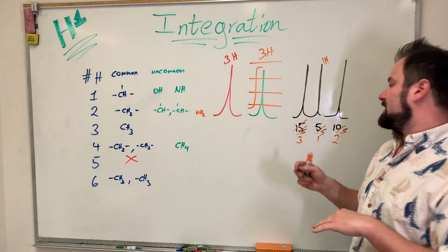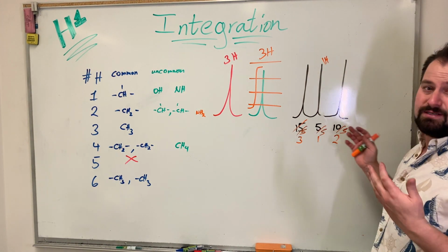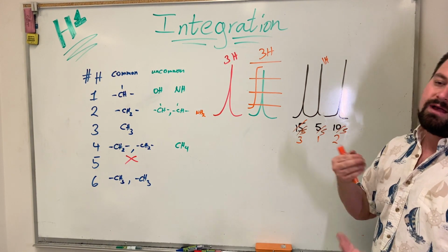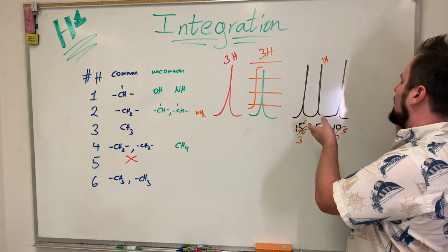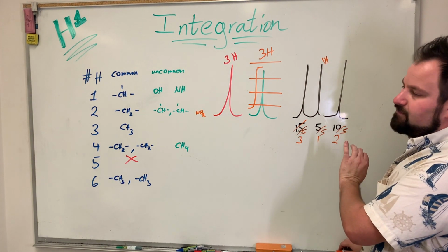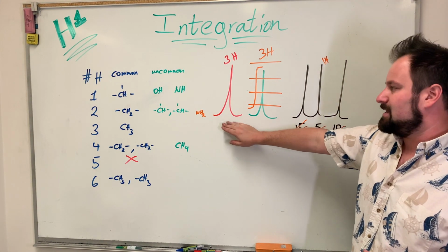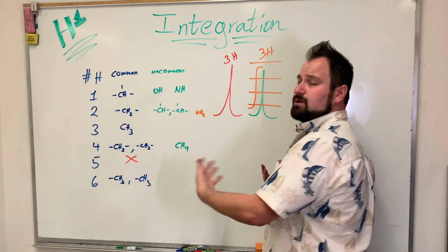This happens, the number is usually not quite as nice and neat. This is closer to reality because in reality, the computer can't tell you specifically 1, but you can usually guess down to what you need it to be. So that's what you often do. But for your thing, most of you are going to get something that looks like this, far easier to handle, especially when you're getting started.